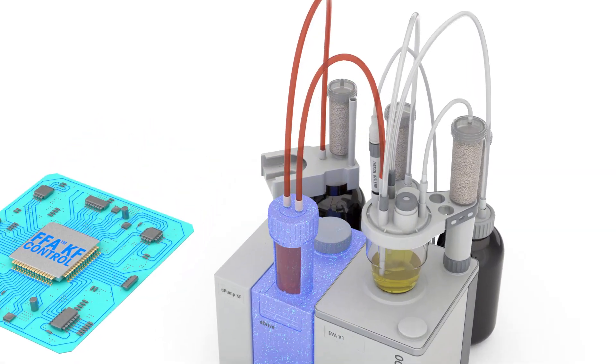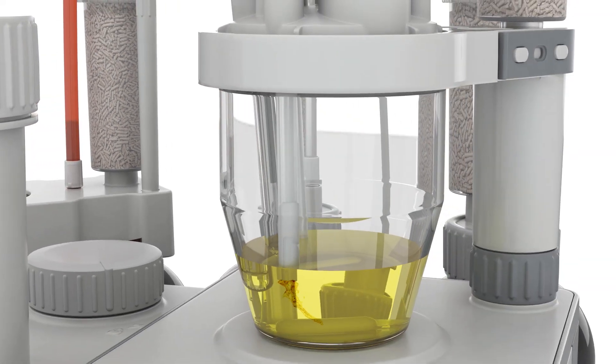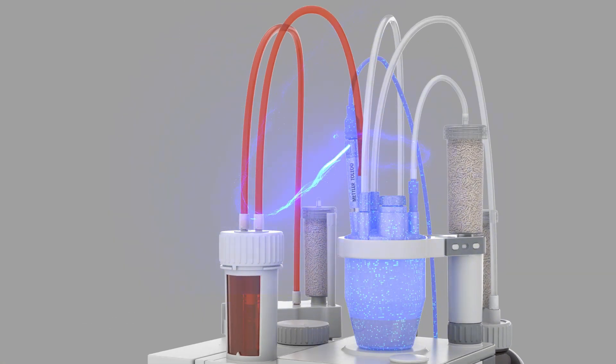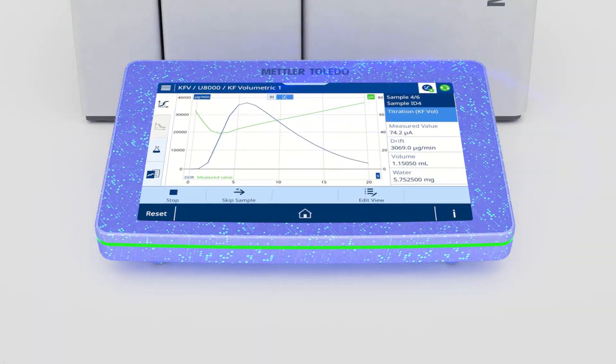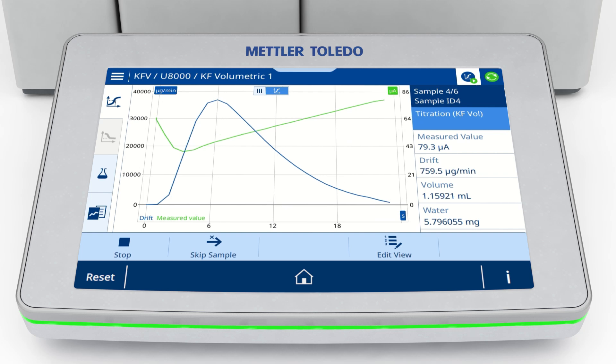The D-Drive provides highly accurate dispensing of the titrant with an impressive resolution of 120,000 steps. The FFA control technology paired with a reliable digital sensor increases reaction rate without sacrificing accuracy. Time to result is therefore exceedingly quick.